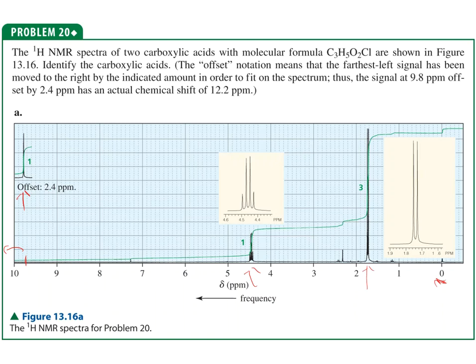Doesn't really matter right now at that moment. And then I've got this other little line that's like right there. There's a possibility of something there, maybe. I just don't know. It also looks like there could be something like right here. I'm not sure, but there's a line that's showing up. And then I also see a small little cluster that's right here as well. So are those appropriate signals? Yes or no? That's something that we're going to have to think about. That's something that we're going to have to look at when we start drawing these structures and try to match them up.